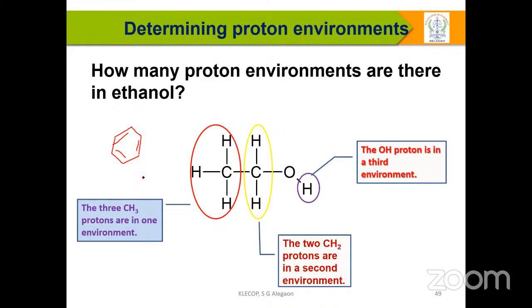It acts as a 1.5 bond character, and all 6 protons are sandwiched in the ring current.